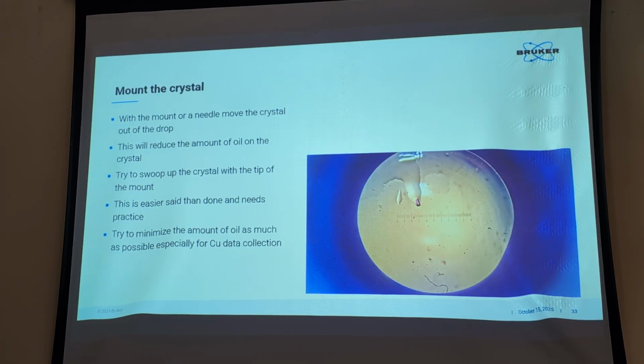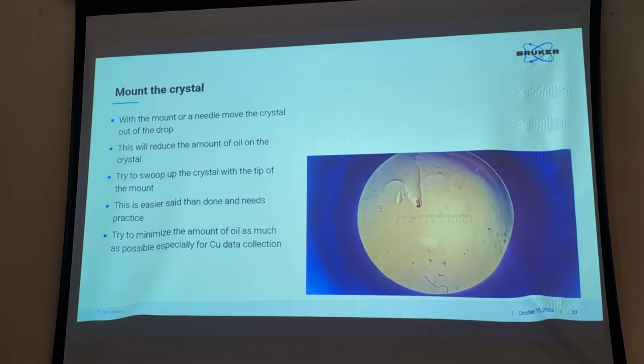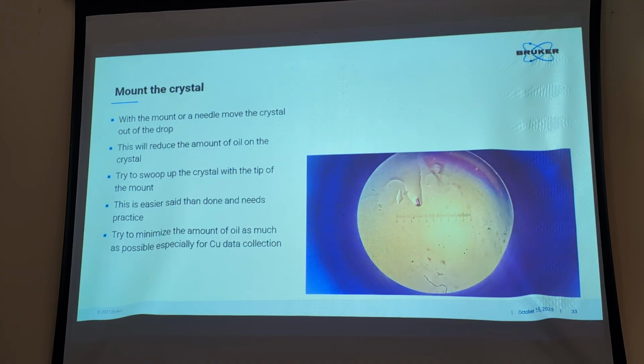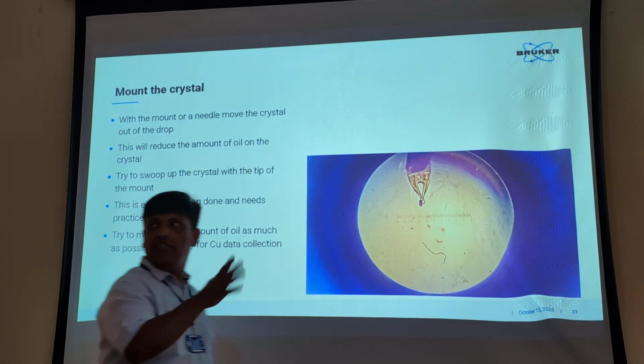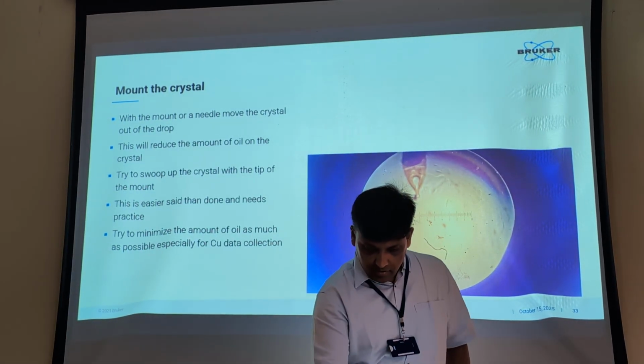Okay, so now he takes the loop. Yes, the loop is there. So now he is going to just scoop it, nothing else. Yes, that's it. We are going to take this onto the diffractometer.